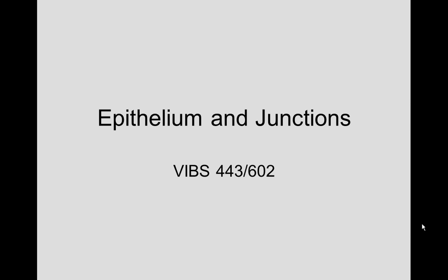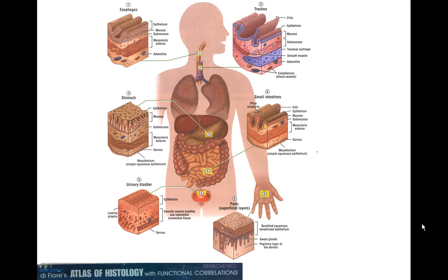Epithelium and Junctions. Here we see a host of different types of epithelial cells.